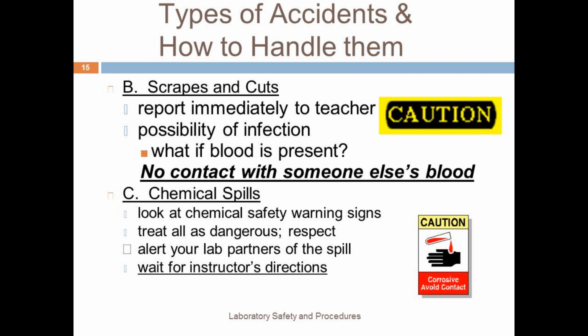Make sure that you treat all the chemicals that we use in lab as dangerous and respect everyone during a lab. Also, alert your lab partners of the spill so they are aware of the situation and know what's going on around them.